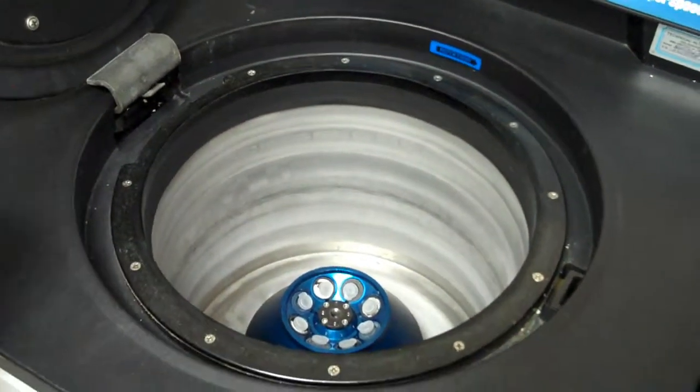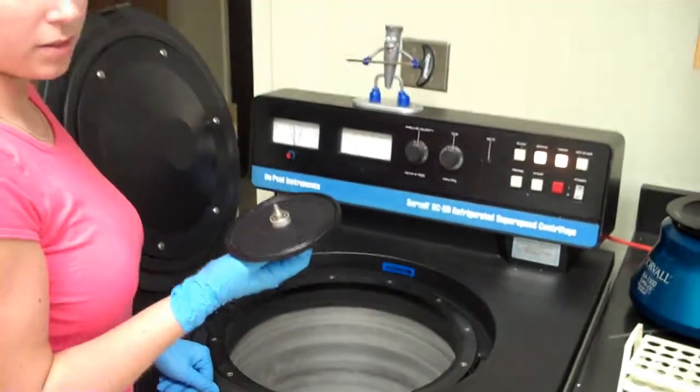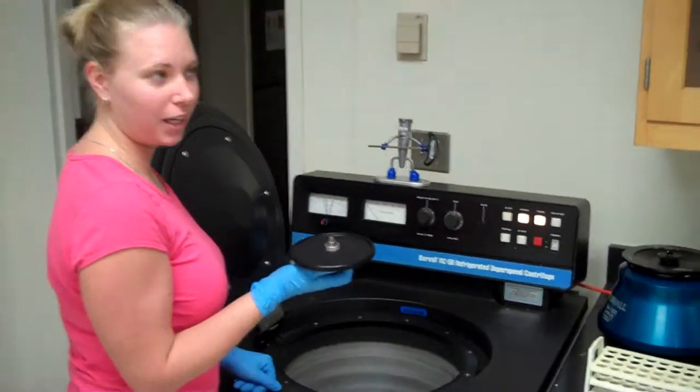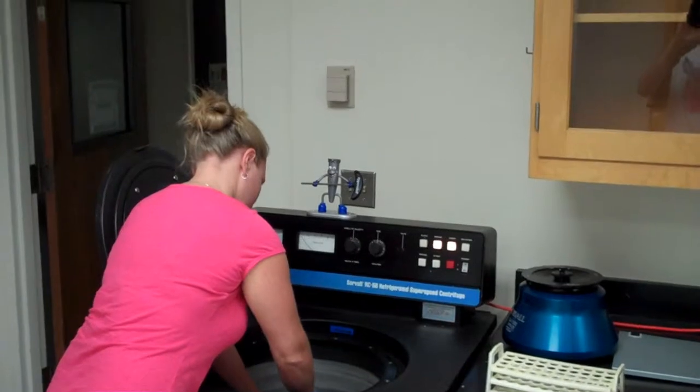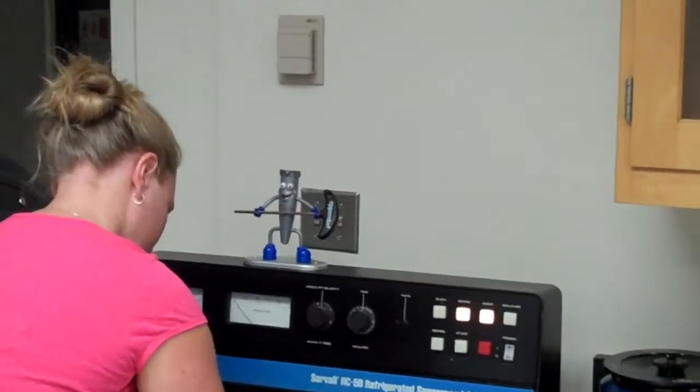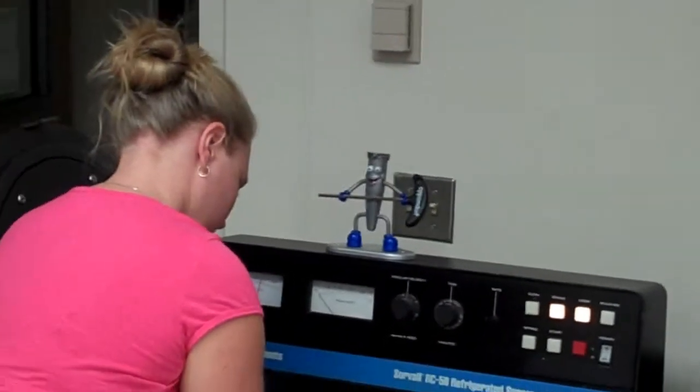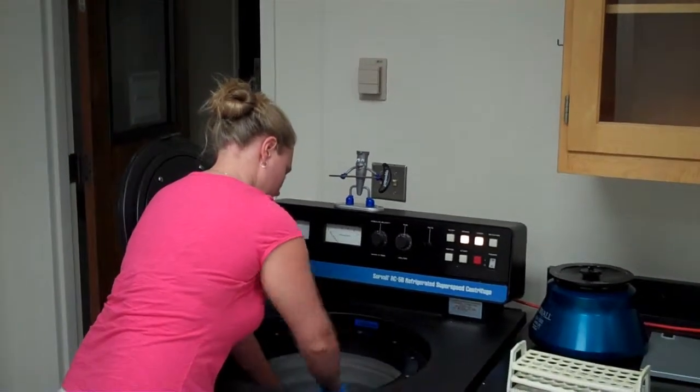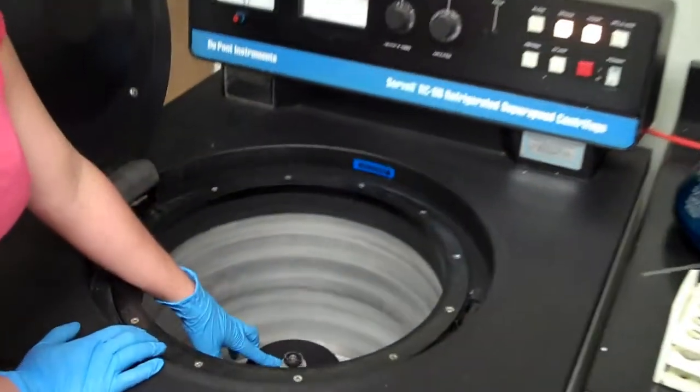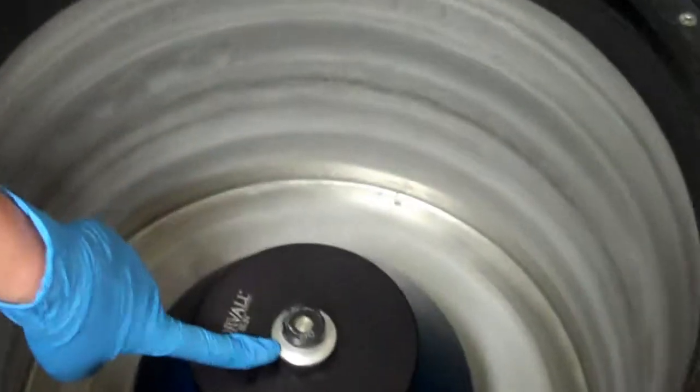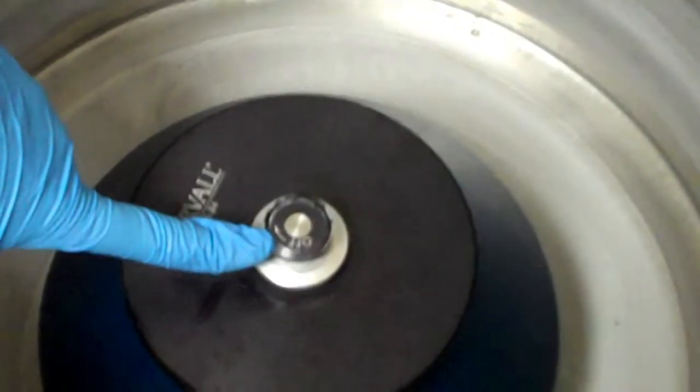Once your centrifuge is loaded properly, always make sure to latch the lid tightly. This centrifuge has two dials. You need to make sure that the silver dial is turned tightly as well as the black dial on top.